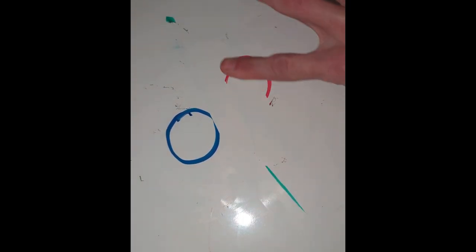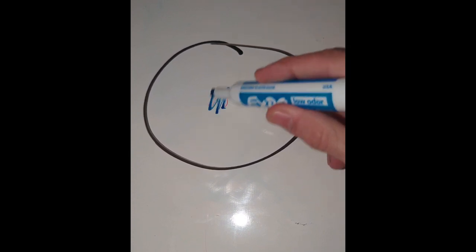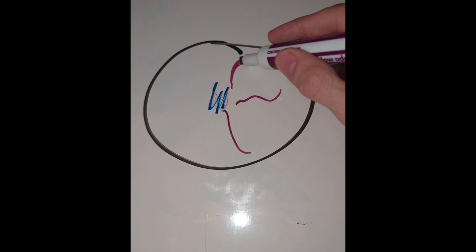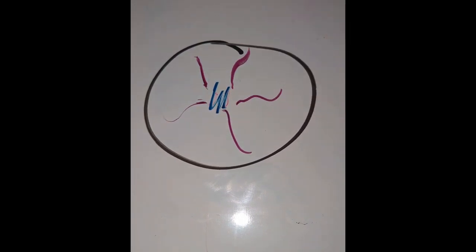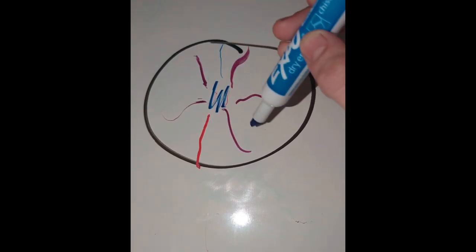But I'm going to take a step back real quick. People say, well, how would you mix spores? There's a lot of ways you can do that. 90% of strains that are out were just mixed by mixing spores. So you take a spore print, you'd have your petri dish, and you throw some spores in one, and then you throw some spores in of another, and they would just grow out in mostly consistent morphologies. However, you don't know that you aren't going to get like a red guy in there or a blue guy popping out here. So wherever you take a transfer off the dish is going to be reflective of different genotypes.